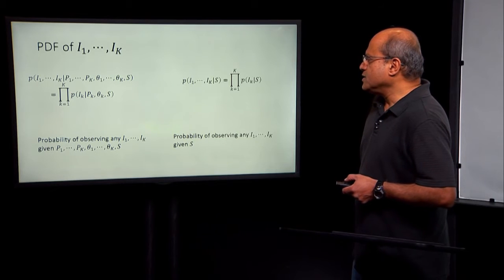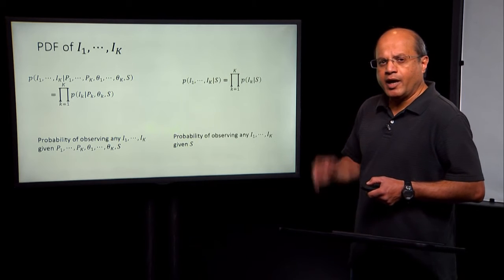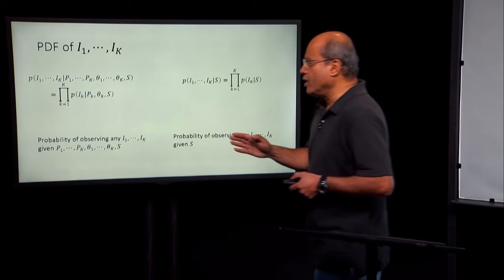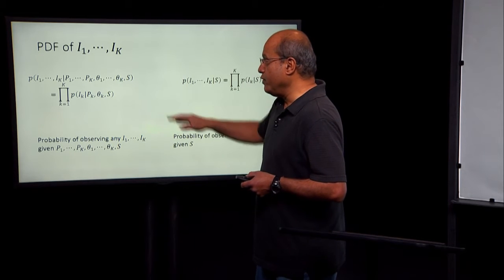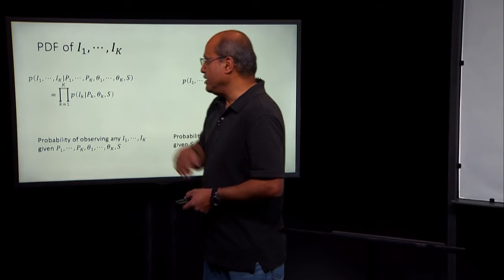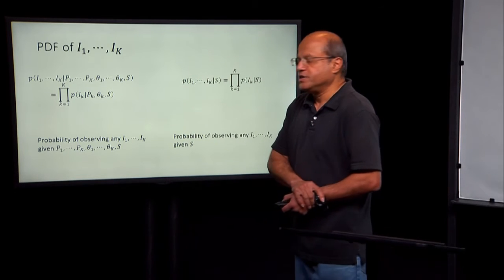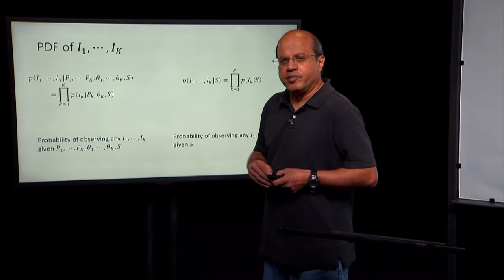And so that's the final modeling step that we have for the image formation model, is that using the equations we have had on previous slides, we can simply write down these probability densities. And it's actually important to understand what this equation represents.